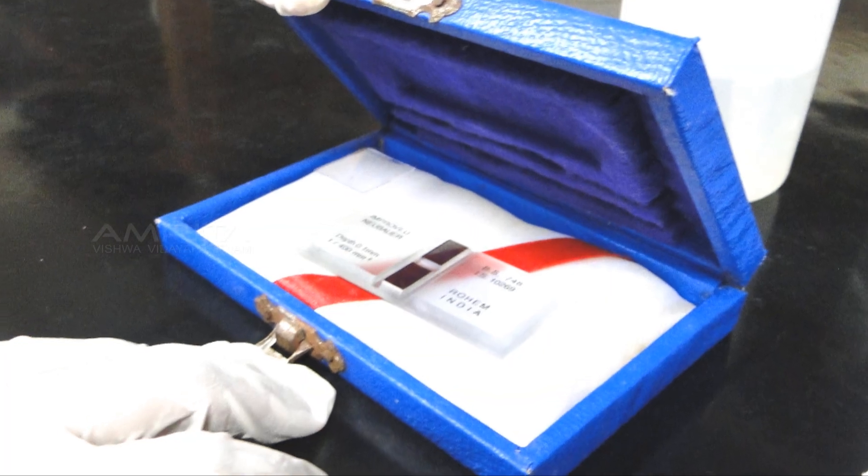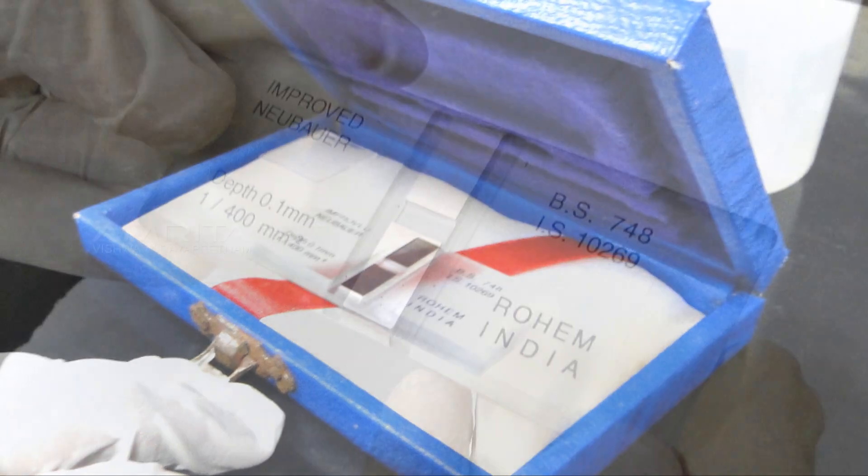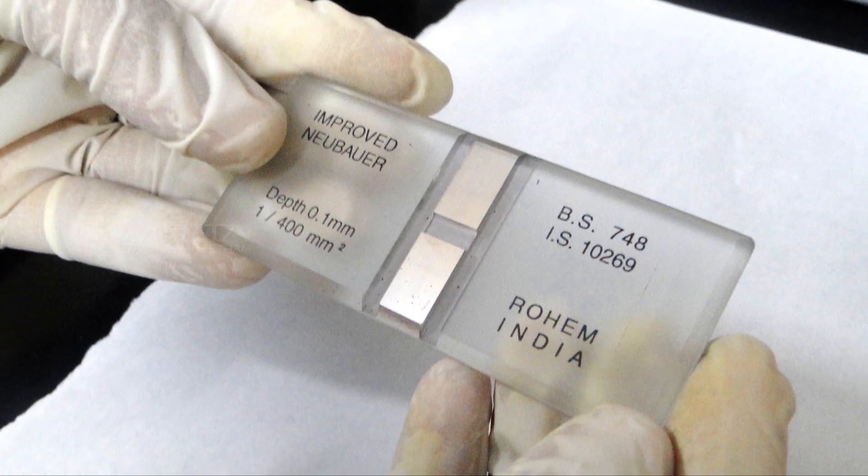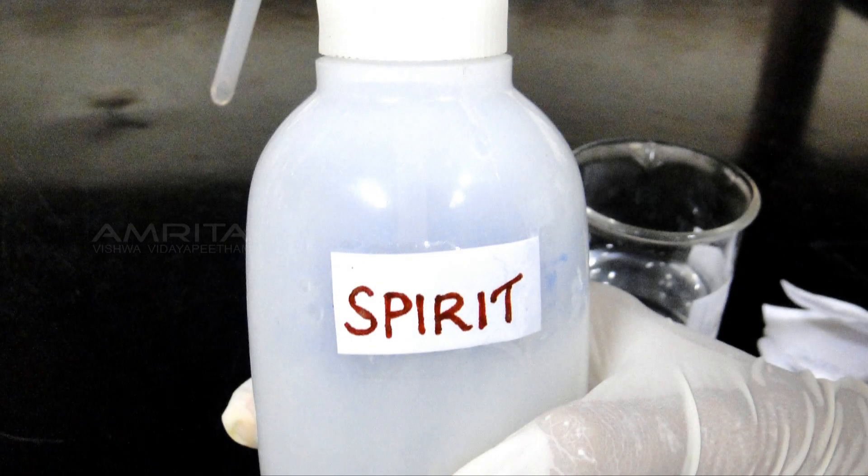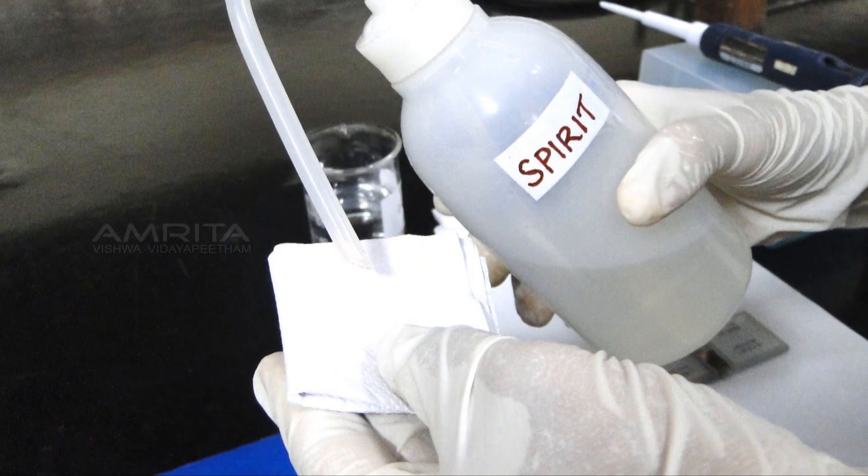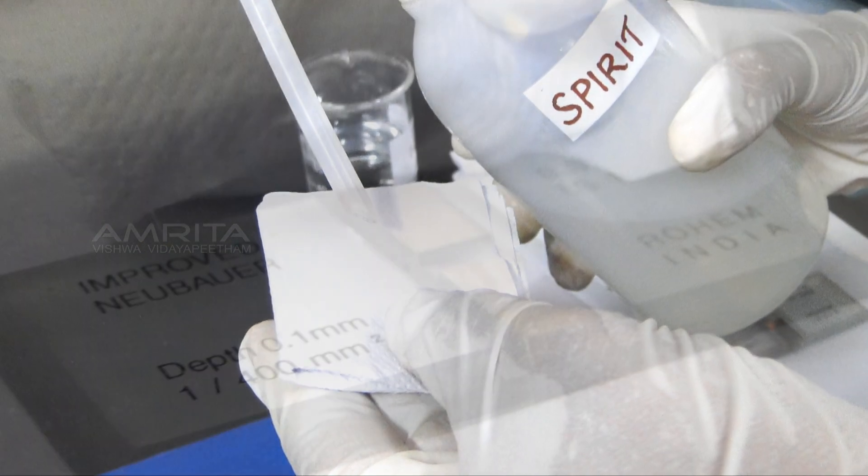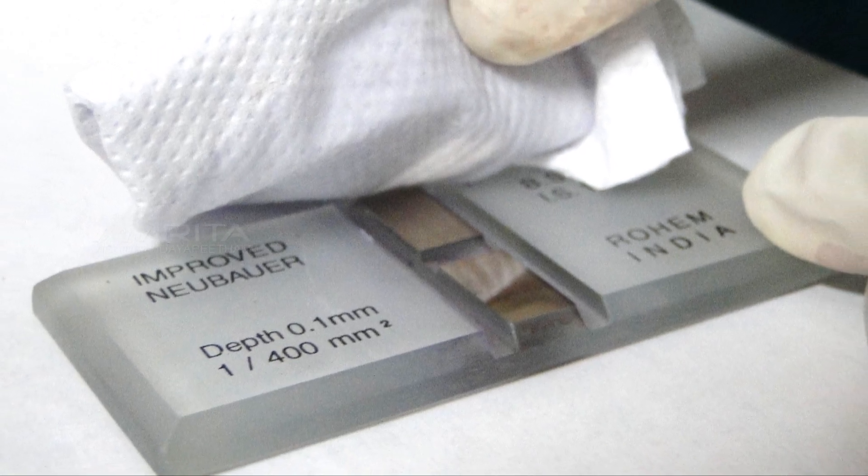Procedure: Take the box containing hemocytometer, open it, take the hemocytometer and place it on a white paper. Take a tissue paper, apply a small quantity of spirit on the tissue paper, and wipe the surface of the hemocytometer.